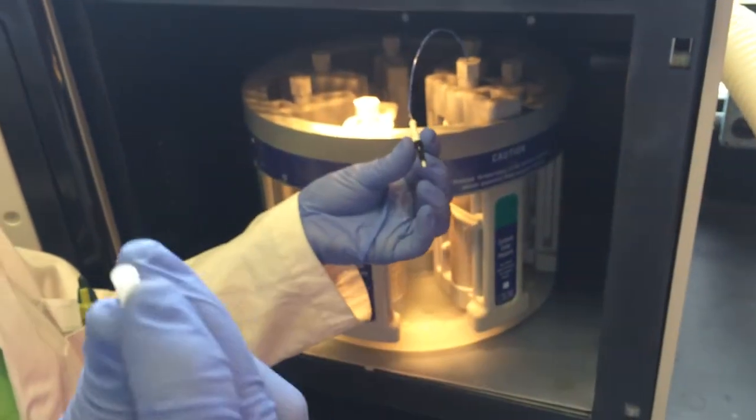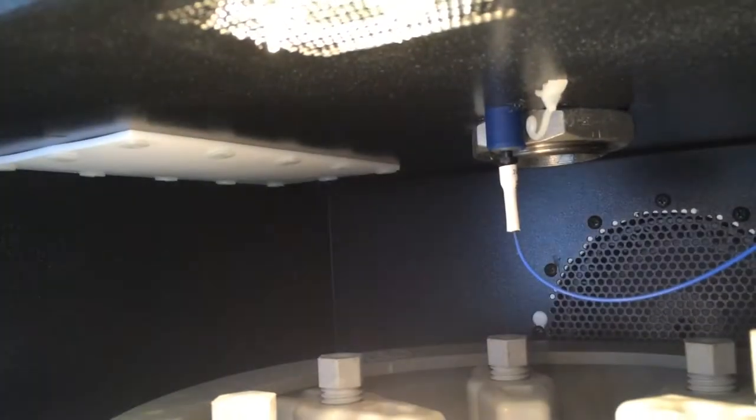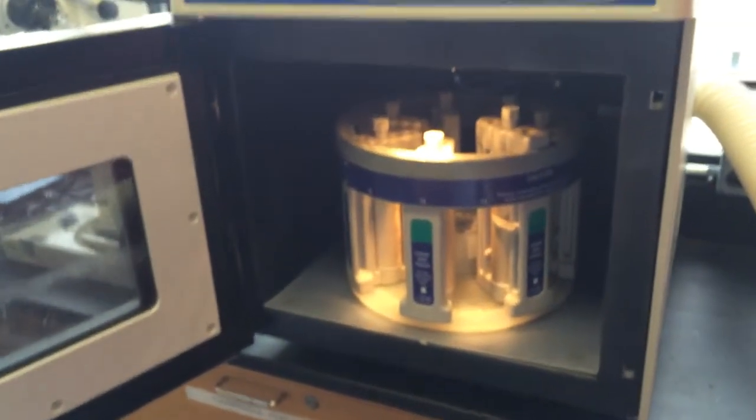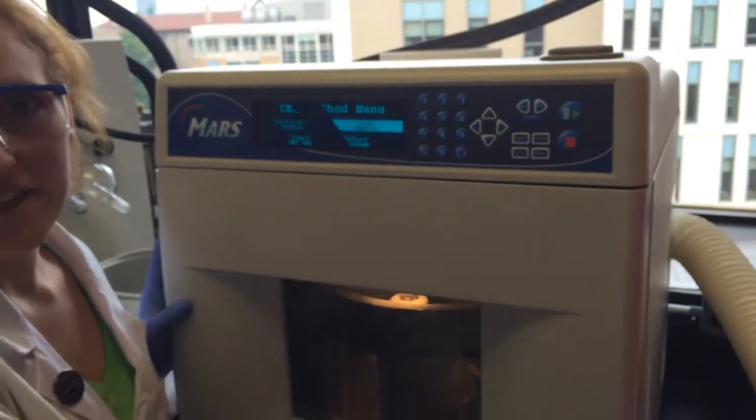The probe has a small cap that needs to come off and is inserted in this small blue cylindrical thing until it clicks. And then it is loaded into the microwave so you can shut the door and proceed to select a method.